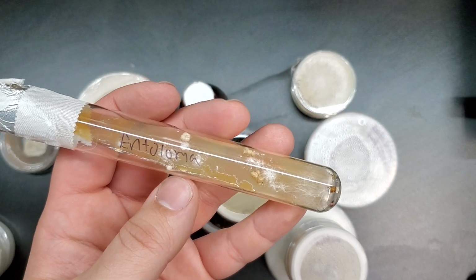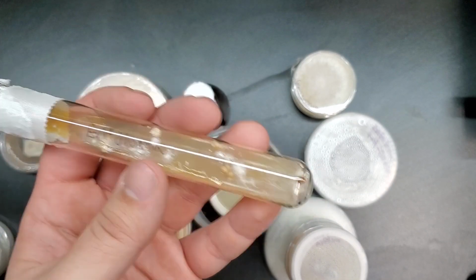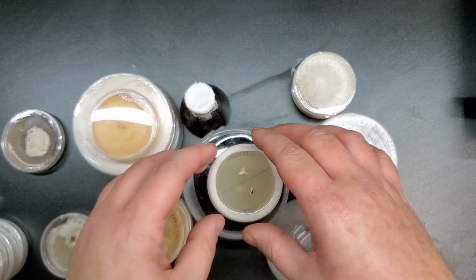So yeah, even the fully developed form of the Entoloma seems to put off the aborted forms of their fruit bodies fairly commonly without any real influence from the honey mushroom, at least here in my lab setting. So that's something that I kind of want to mess around with, which is why you can see right down here in the middle are some petri dishes that I just inoculated today.